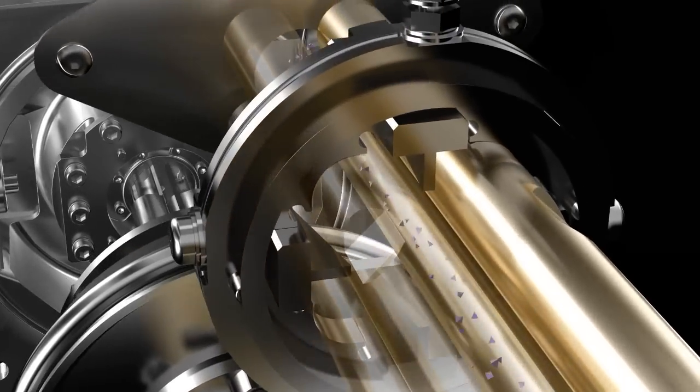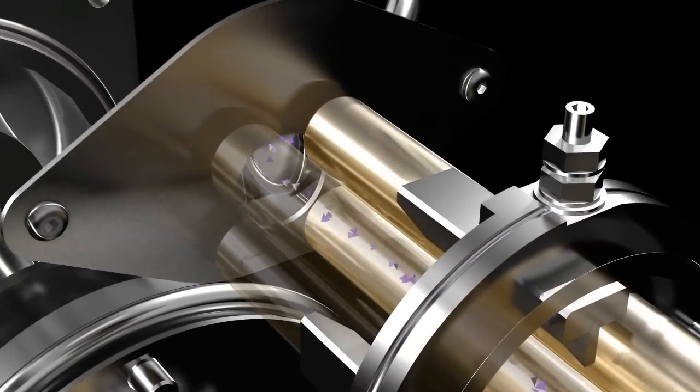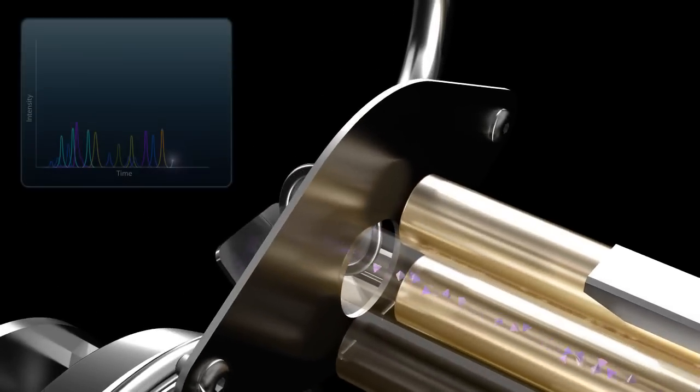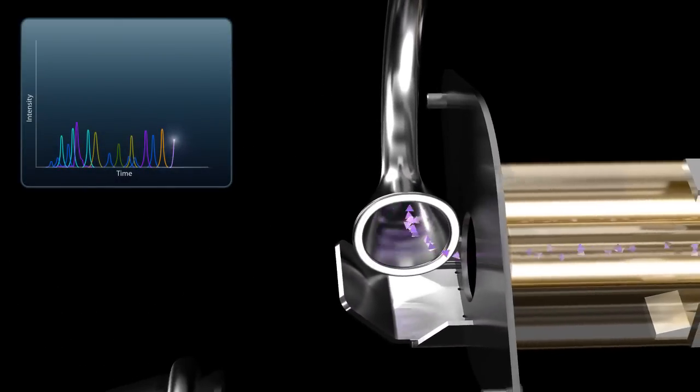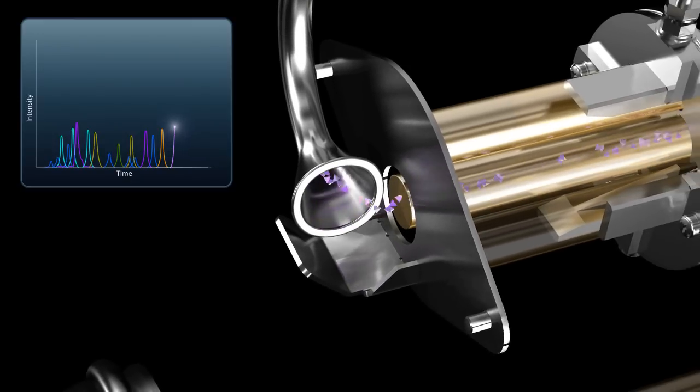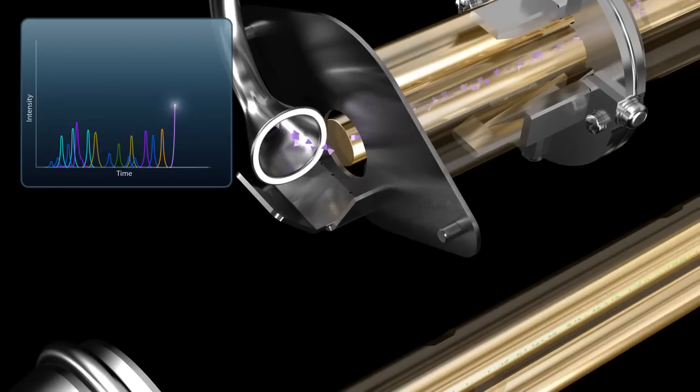When the QTRAP 5500 functions in triple quadrupole mode, Q3 transmits specific product ions to the detector to generate gold-standard MRM quantitation, and the new accurate detector uses pulse counting to improve accuracy and precision relative to traditional analog-based detectors.